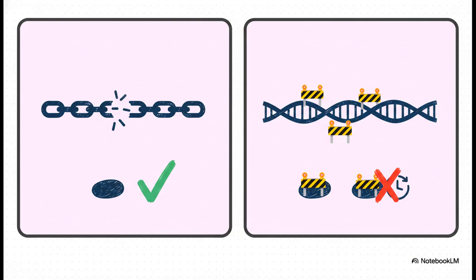The first is degradation. That's a physical problem where the DNA strands are literally broken into smaller pieces. The bigger DNA targets are just more likely to have a break in them, so they don't amplify. The second cause is inhibition, a chemical block. The longer the DNA target, the more likely the polymerase will run into an inhibitor and just fall off.